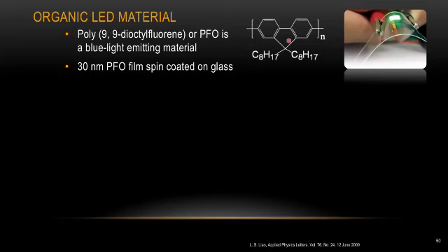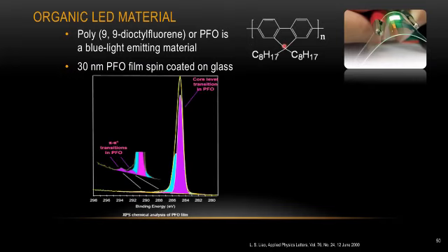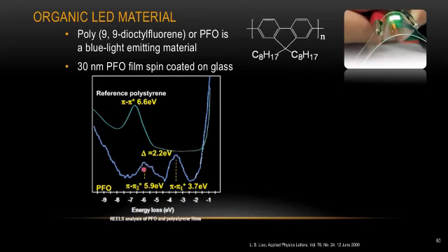Once we get this sample, the first thing we do is an XPS measurement to see if there is any contamination on the surface. Then we do a high resolution scan for the carbon C1s to determine different carbon binding energies. You can barely see some kind of pi-pi* transition down here, but it's not very obvious. So we go ahead and do a REELS measurement to get a more obvious pi-pi* transition with different energy levels.